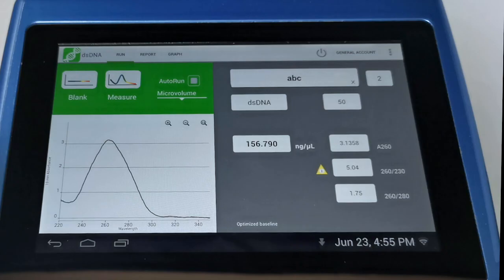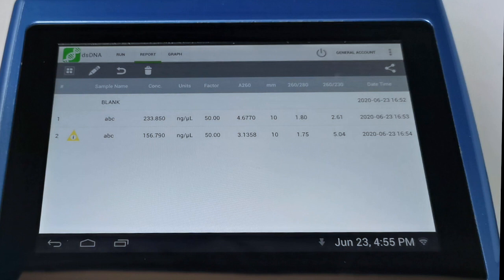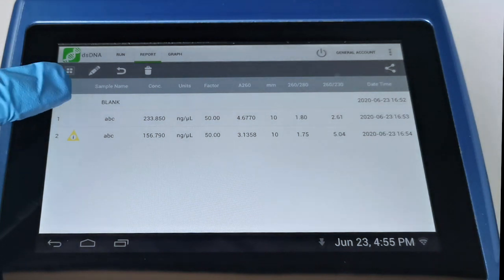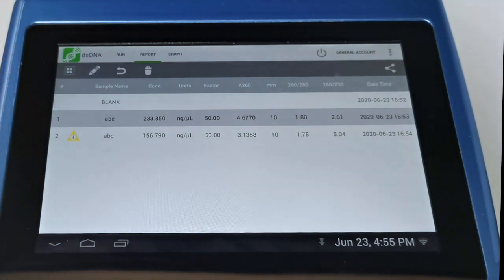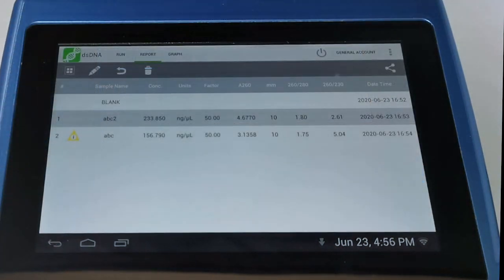The contamination alerts check purity ratio values against accepted thresholds — these are commonly accepted values hardwired in, but they can also be set as custom values. If we touch the yellow triangle, we get detailed information about what might be the issue with the sample. Once we've run our samples, we can swipe to the report screen where the data we've captured is presented in tabular format, including the sample name if entered.